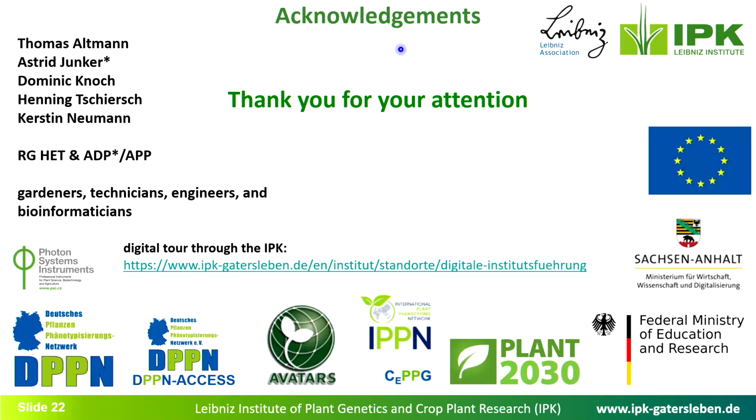Metal halide lamps were turned off, only LEDs were on, and ultraviolet with reduced intensity. So we reached around 400, 450 micro-Einstein on these days. And we furthermore simulated some light flecks, so 8 hours of light flecks and fluctuations distributed throughout the period. And because we are simulating a whole growing season, we also adapt the day lengths every week, both for temperature and for the light simulation, to longer days until the 21st of June, and then reducing the day lengths again until September, October.